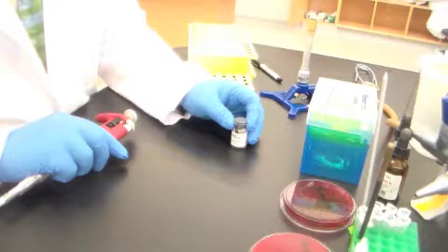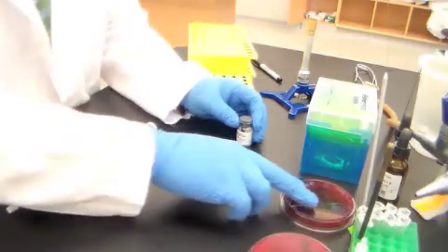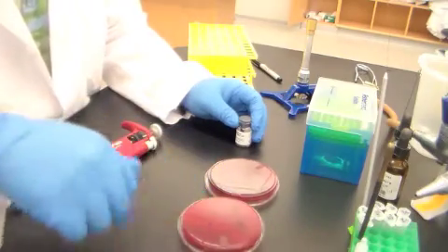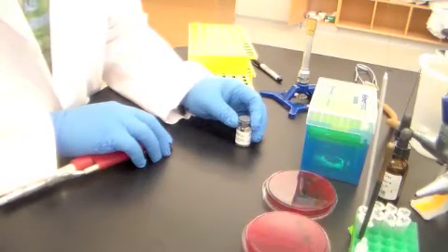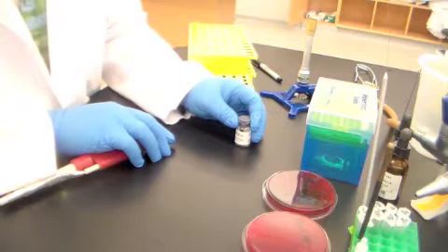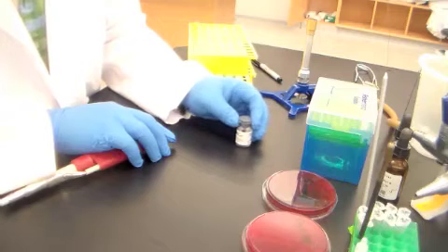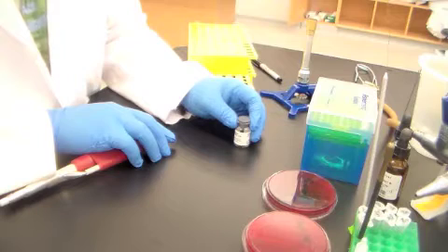The coagulase test is used to assay for a specific enzyme, which is an important virulence factor in staphylococci. Those of you who go on in the biomedical field will perhaps never hear staphylococci referred to as Staph aureus, Staph epidermidis, Staph saprophyticus, as we use here in the laboratory. You'll most often, in the medical context, hear them referred to as either coagulase positive or coagulase negative staphylococci, or sadly, methicillin resistant staphylococci. But that's another story. What you're going to do today is to assay for this important virulence factor.